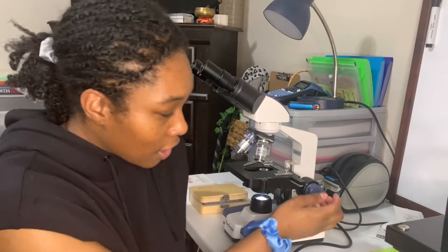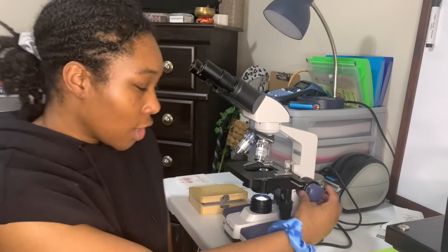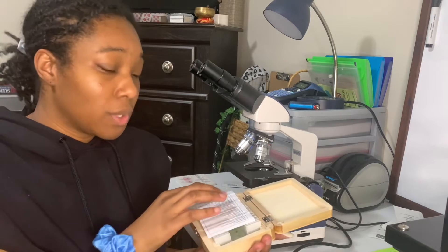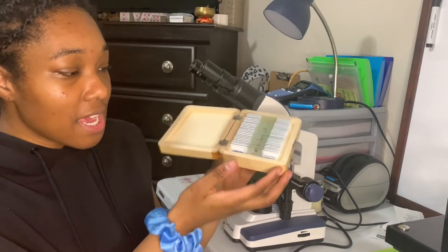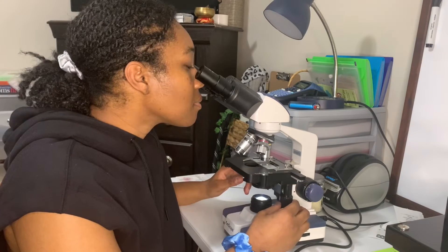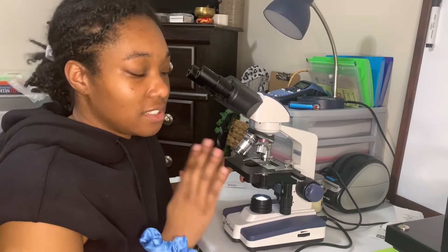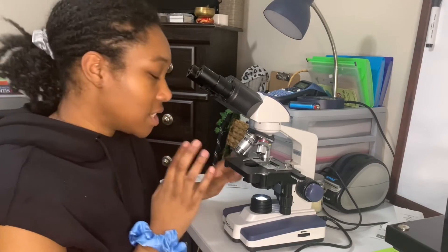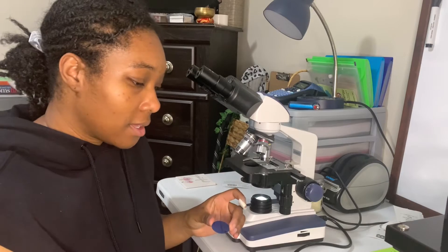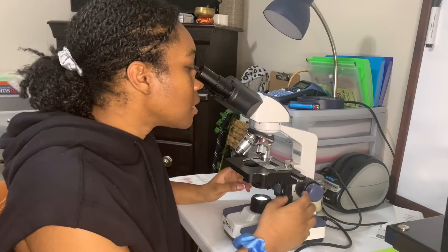Now I know a lot of y'all probably already know the common microscope anatomy, so I'm not going to go into that. I did order some Amscope slides and I think it came with 25 slides — it looks like this, it's very nice and organized. I wouldn't view stuff that has already been stained. I don't like things that have been stained, and you probably don't need to use the dark field filter for this, so I'm taking it out and putting it back in the plastic.